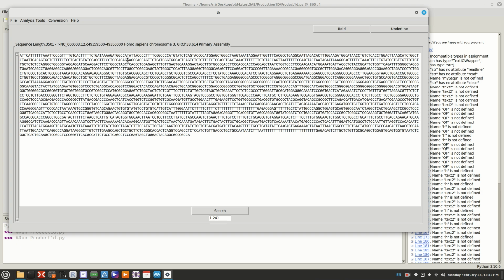So we're looking for 20. Wait, how big is this? 35. Okay. So 24, it's towards the end. Did we make a mistake and not put 1,000 on the right side? We might have. This is actually the part that's common, outside what we thought was the coding sequence, but this is what we found. So we will record this regardless. No, I guess it's probably just at the end maybe.